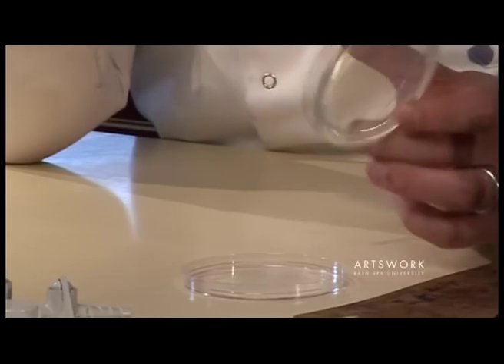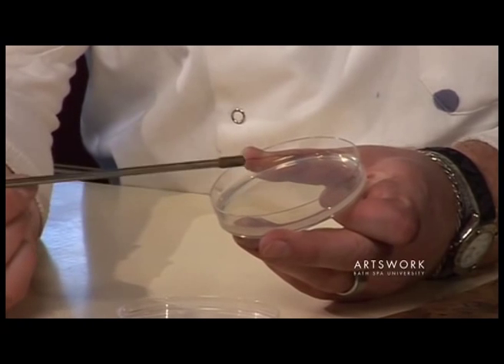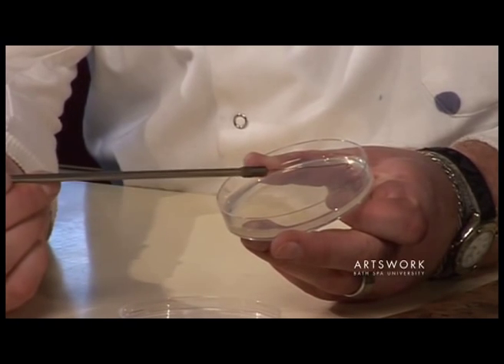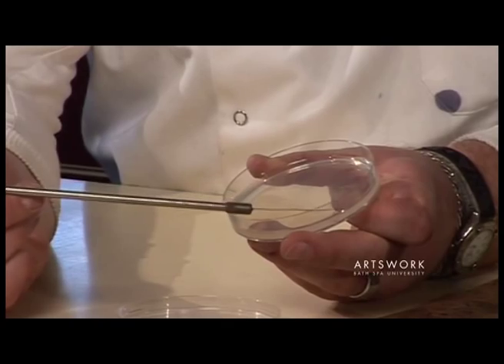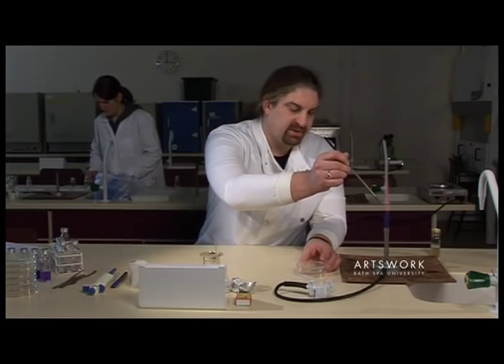Once the loop is cool, turn the plate back over and find the original spot. Using very little pressure, streak out four or five times from that original spot across the plate.